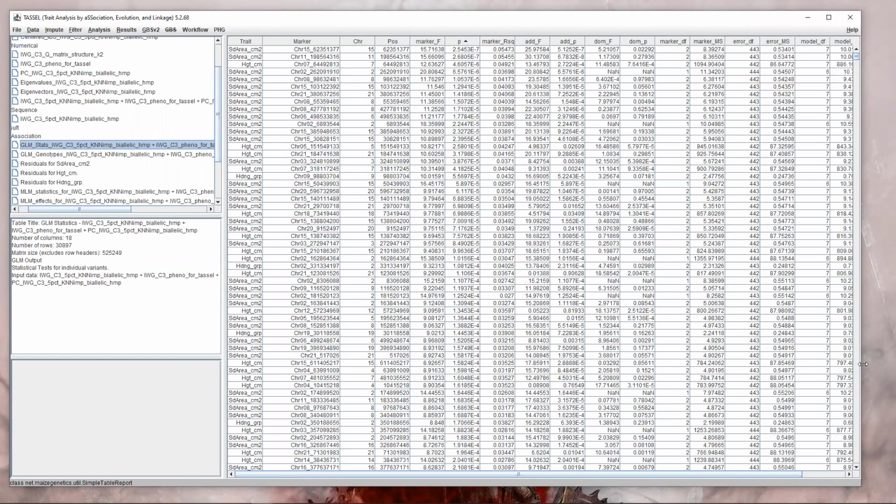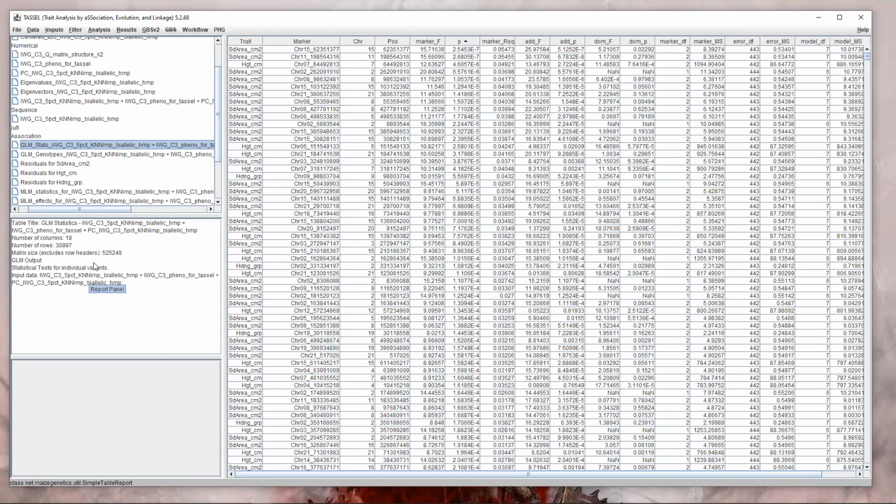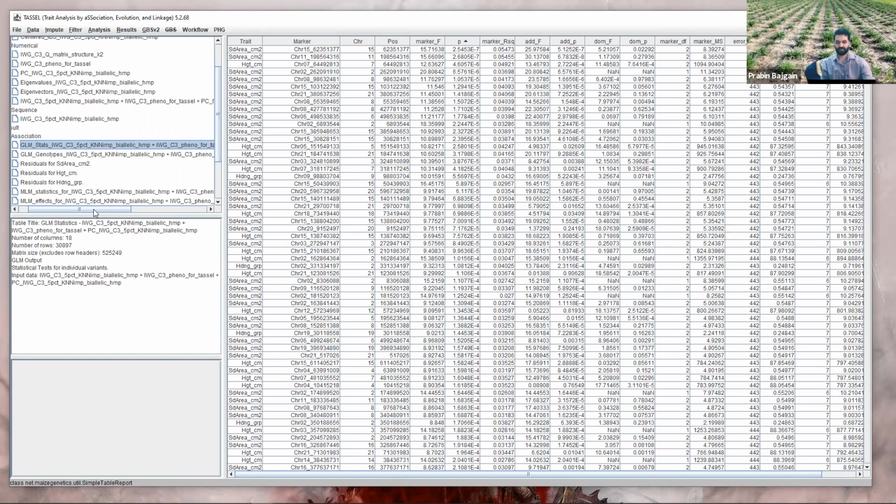I have a question about the imputation that you did. So intermediate wheatgrass is an outcrossing crop, right? Correct. How well does the imputation work for you? Pretty good. I will have to pull up the exact number, but it's above 90%, close to 95.